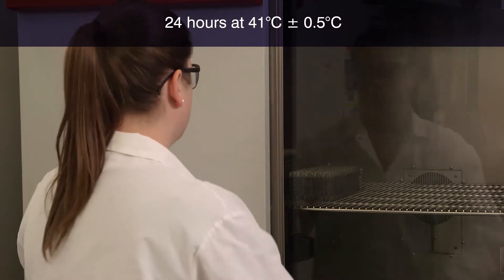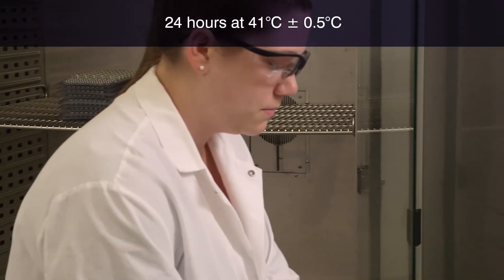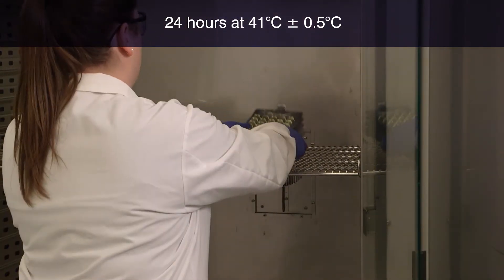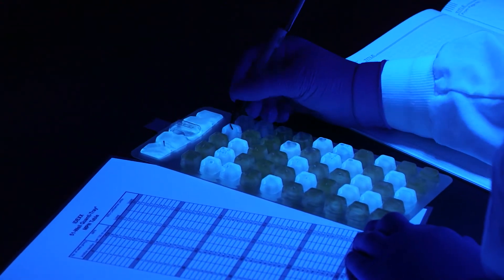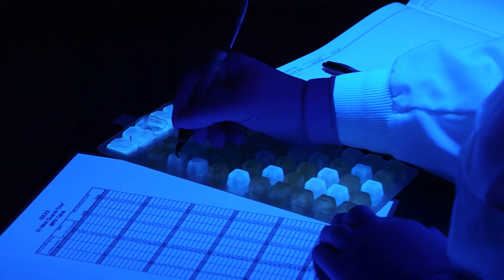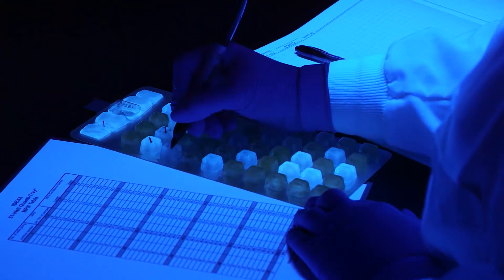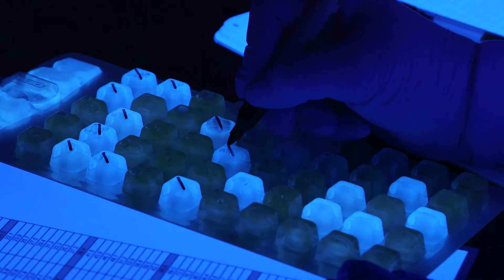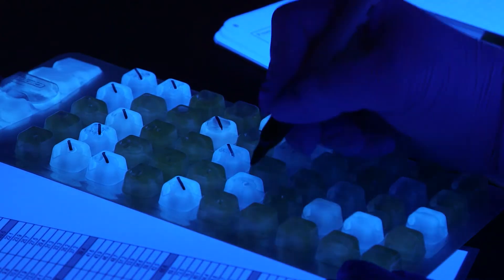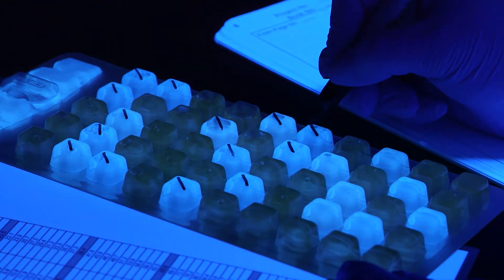Incubate the sealed tray for 24 hours at 41 degrees centigrade, plus or minus 0.5 degrees centigrade, or according to your local regulations. After incubation, view the Quantitray with a UV lamp in a dark environment, shining the light away from your eyes. Keep the light within 5 inches of the tray. Mark each blue fluorescent well with a permanent marker, including the large overflow well. Count the marked wells and then refer to the MPN table included with the Quantitrays.